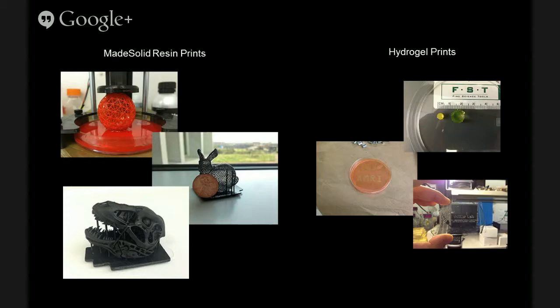So whatever method is used for bioprinting, considering the complexity, would have to be a non-scaffold requirement, which would disqualify two of those three methods. Well, I mean, you can still do, for instance, this complex structure with a lot of negative space in here with SLA.